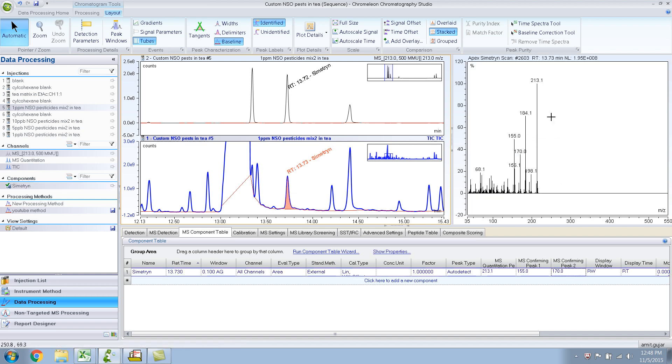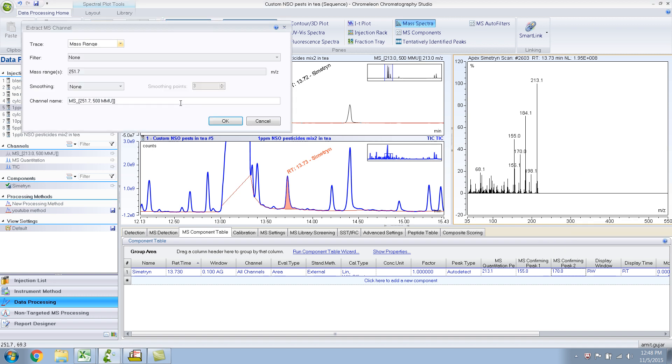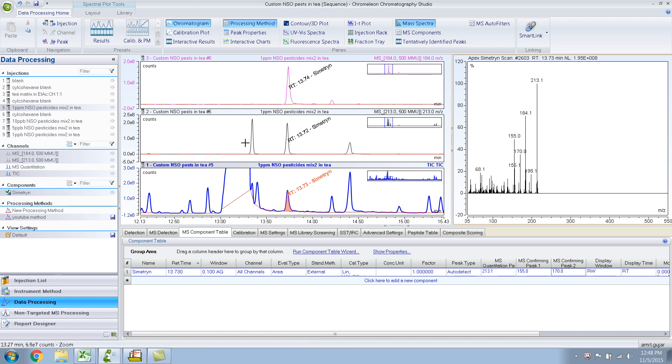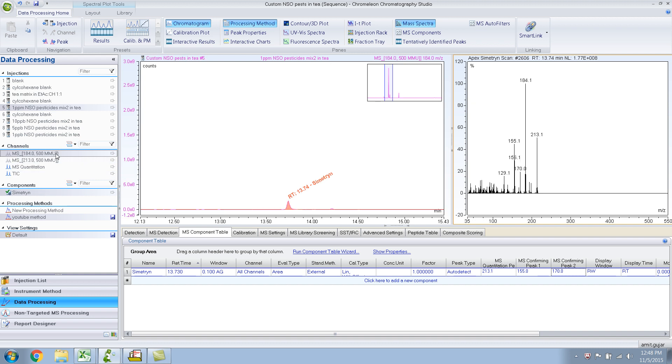I want to make sure I want to see what it looks like. So extract 184, click OK. And this is 184. Let me do this - I don't want to see the TIC now, so I will just look at the 184. On the left hand side in the channels, it has extracted 184 ion.